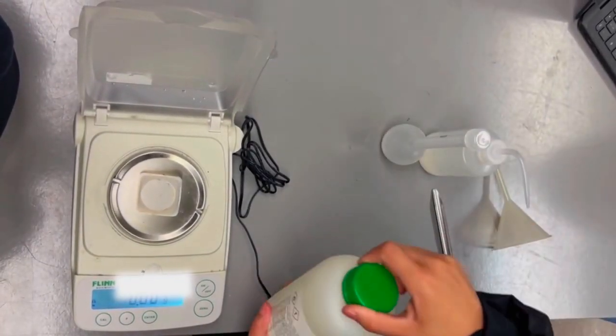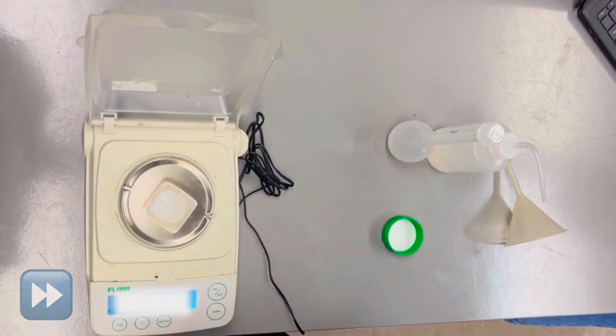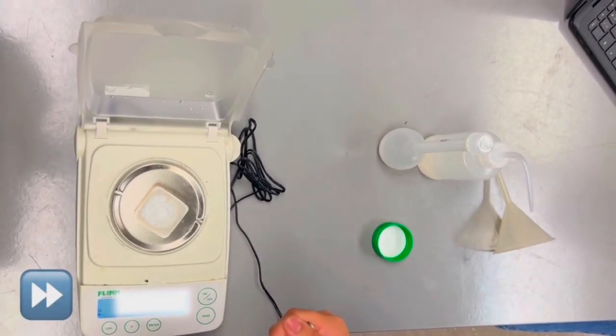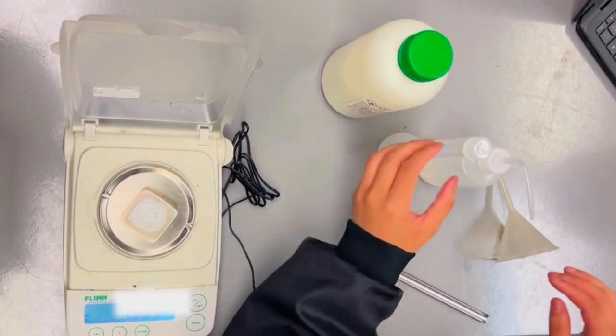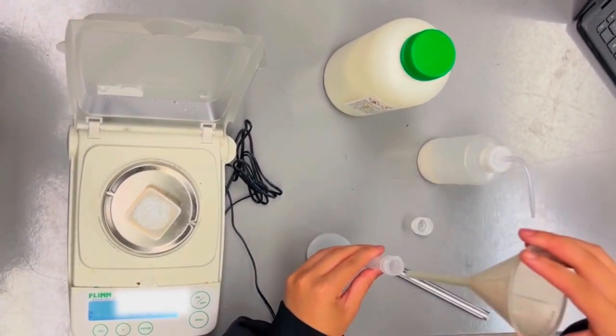You will need to make three solutions for this lab. Transfer the solid onto the weight boat using the spatula. Once you have the correct mass, insert a funnel into your 100 milliliter volumetric flask and transfer the solids into the container.